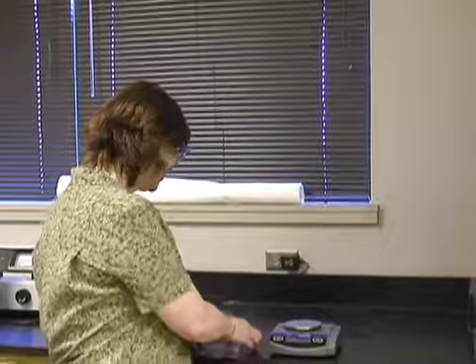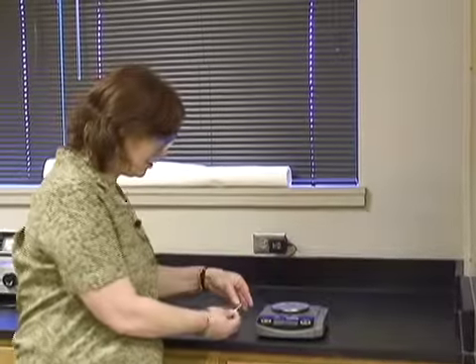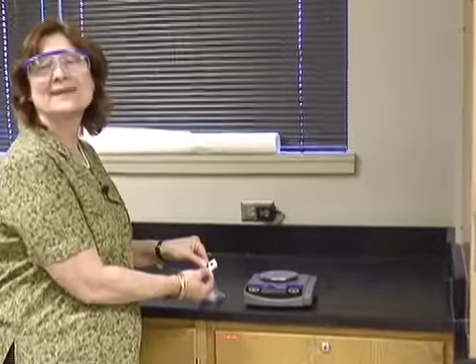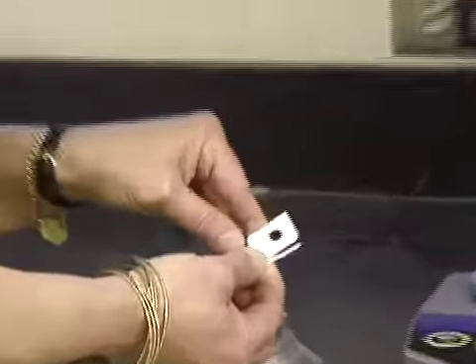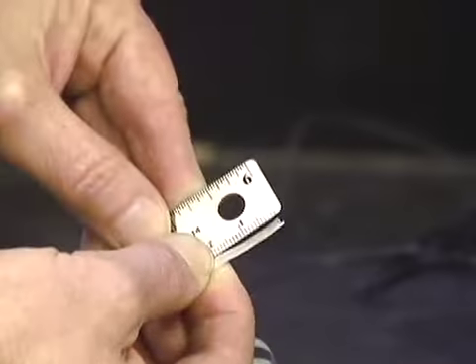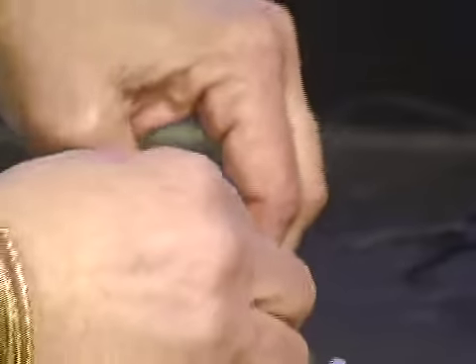But anyway, the first thing we need to do is measure the mass of the magnesium. I'm going to measure out 2 centimeters. And here we have 2 centimeters. And I realize that it's upside down. However, magnesium is so soft, I can just tear it. I will tear the magnesium.